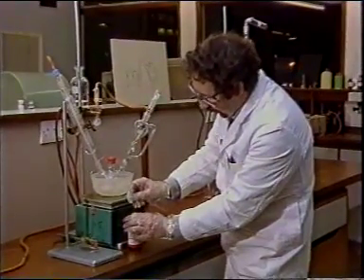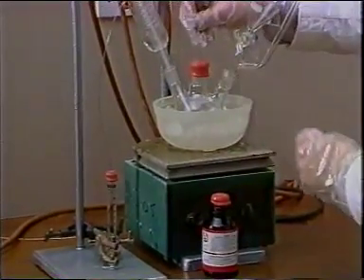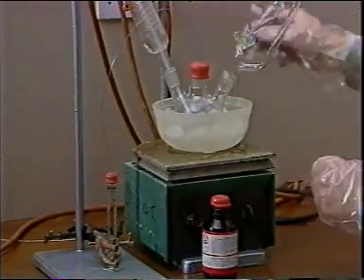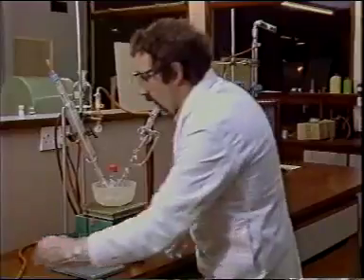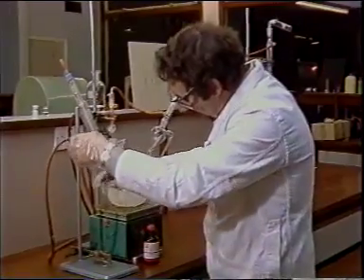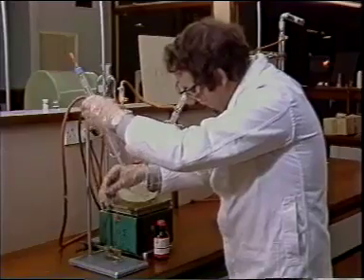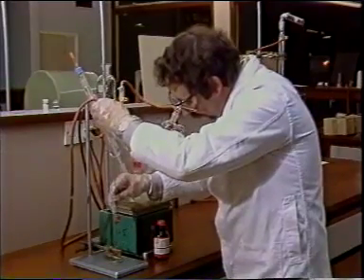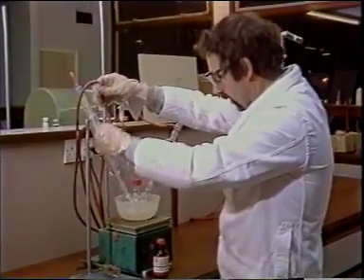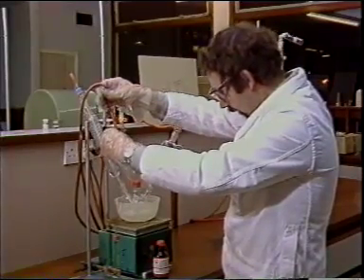We now remove the catheter from the reagent bottle and rapidly insert it through the septum into the reaction vessel. Now, using our nitrogen line, after pushing the catheter down to the bottom of our measuring cylinder, we transfer from cylinder to reaction vessel by turning on the nitrogen pressure.